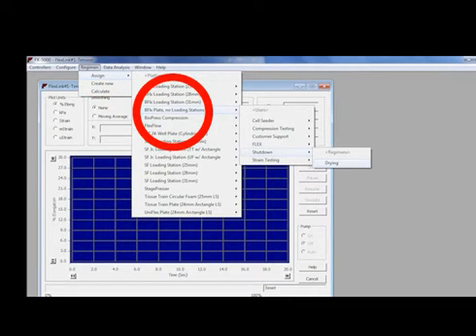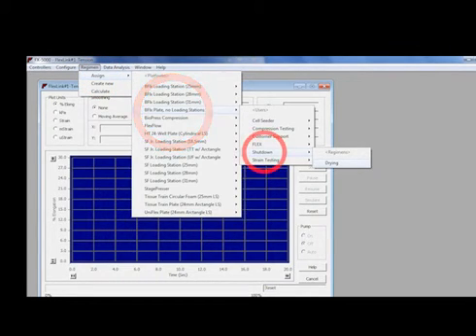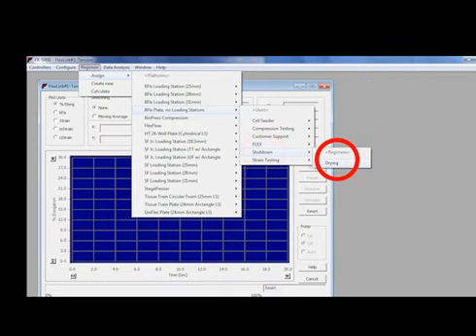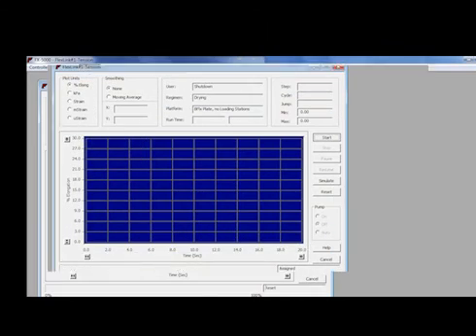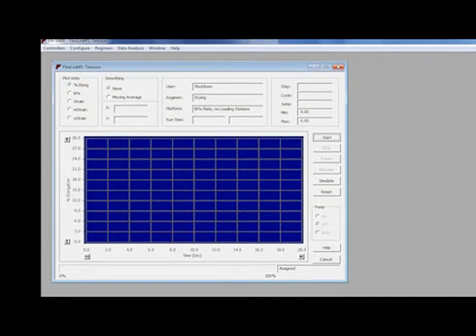Choose the BioFlex Plate No Loading Stations Platform Assignment, the Shutdown User Name, and your Drying Filter Regimen Name. The control panel window for your regimen will open up.